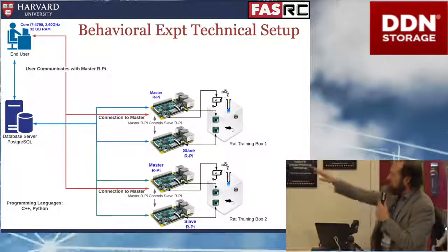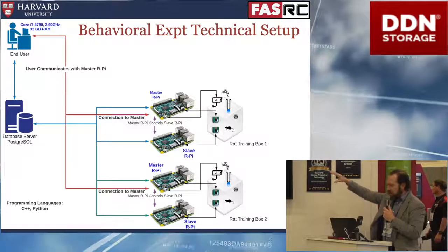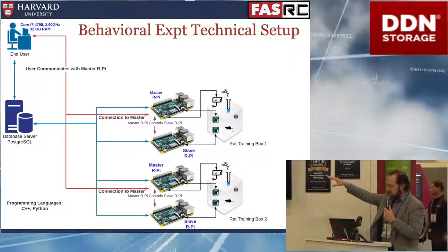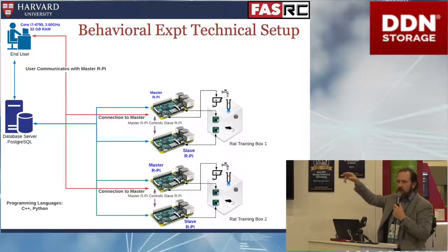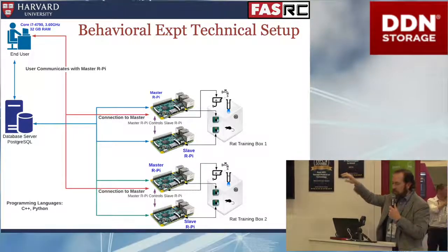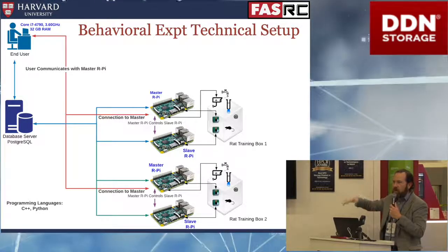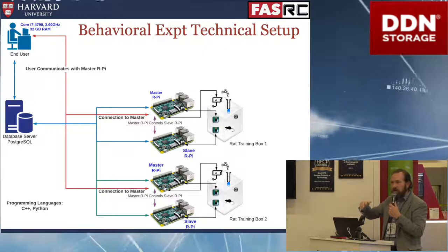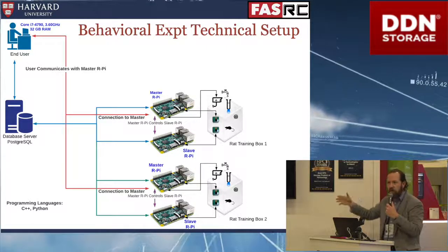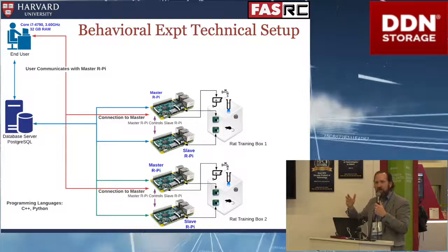So essentially what we have are these housed environments. There's two Raspberry Pis that are hooked to each one of these boxes. So they generate data because they have cameras on the video. There's also all sorts of analog types of devices that are attached to them. This is analog for providing water, and there are different levers in the box that the rats have to use to do these sequences. And when they do the sequences, they get rewarded with more water. Rats love water. And so you can get them to do all sorts of interesting experiments.